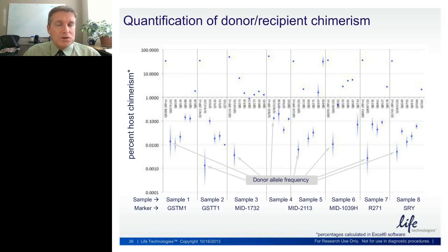And I have to say that you could do the same thing with traditional quantitative PCR. In fact, this is what Dr. Jimenez Velasco was doing for a while. But he wasn't able to have the same sensitivity. He wasn't able to see these rare events of the recipient genotype coming back up in these early stages like he was able to see with digital PCR. And that's because there's so much of the donor that was swamping out the signal from the recipient. Digital PCR was allowing him to see the repopulation of the recipient's blood cells with the recipient's genotype before regular traditional PCR was able to.